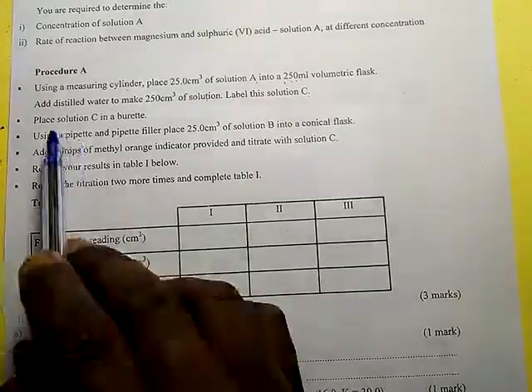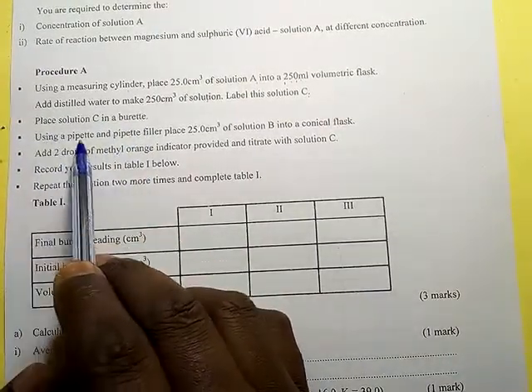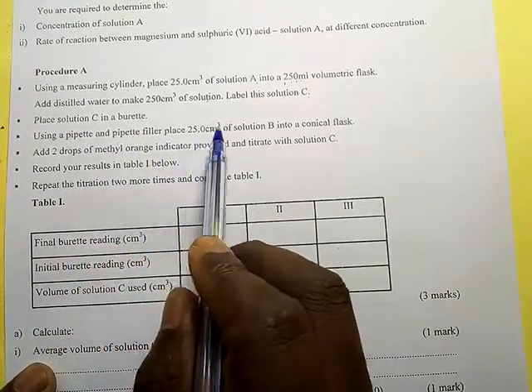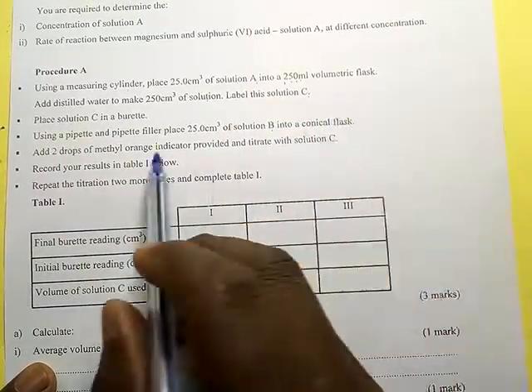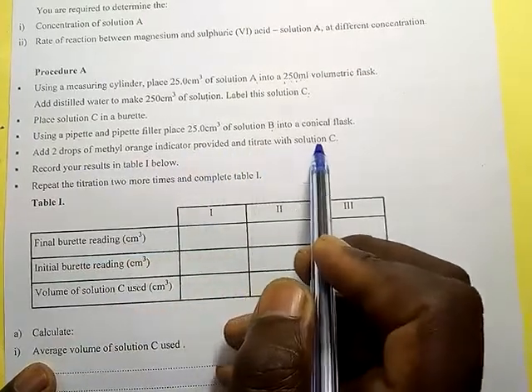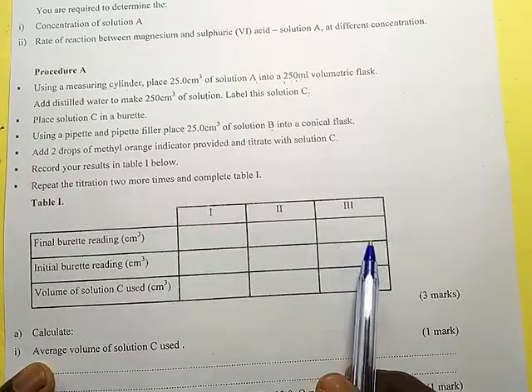Place solution C in the burette. Using a pipette and a pipette filler, place 25 centimeters cube of solution B into a conical flask. Add 2 drops of methyl orange indicator provided and titrate with solution C. Record your result in table 1 below.